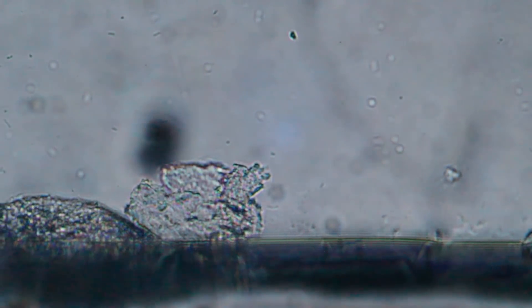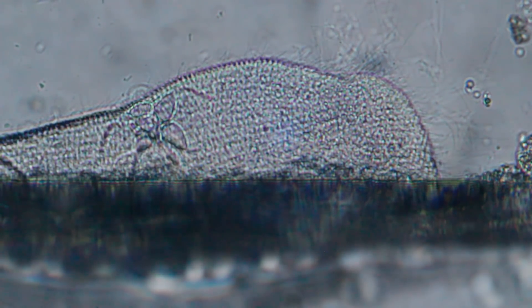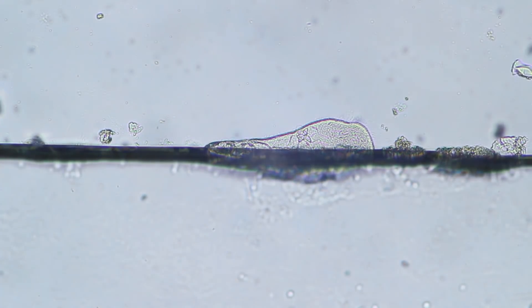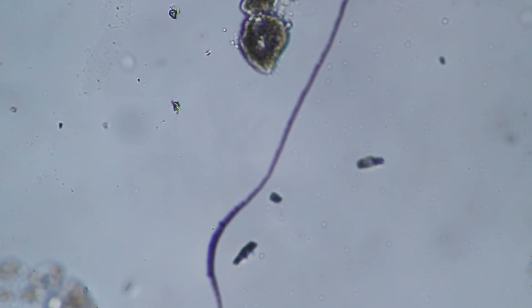And then all of a sudden I saw here on the side that there's some stuff oozing out — the cell already broke open. It's losing its cell organelles. You've got all of the cell organelles and all of the cytoplasm oozing out here. Now it does look pretty dead. You can actually see that it looks kind of dead. Zooming out again a little bit — and here it is. Unfortunately, our little dead Paramecium.